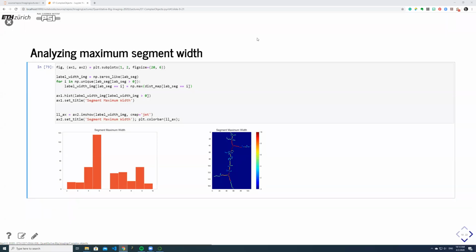So, back again from the break. Let's see, I got unmuted, good. I don't know what happened. Probably I lost the loading of an image at some point.